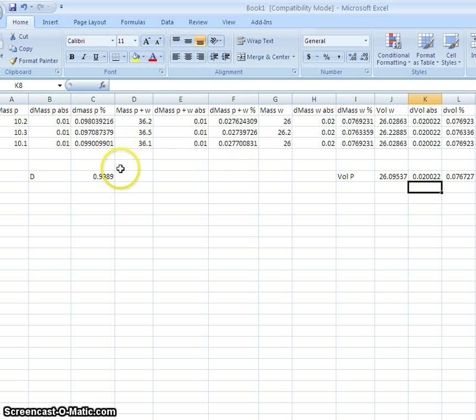But anyway, at least the calculations are done, and this will save us some time with some of those tedious, repetitive calculations. Maybe in this lab it took you a little bit more time to get used to this, but as you use Excel more and more, you could have probably done what I just did here in about 2 to 3 minutes.